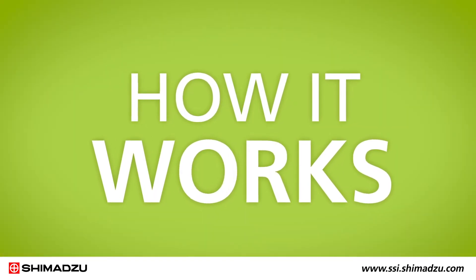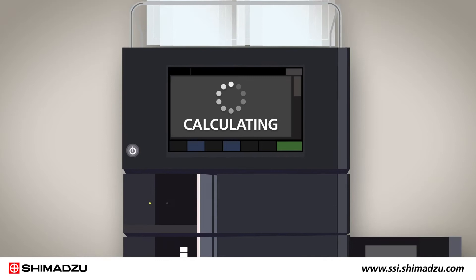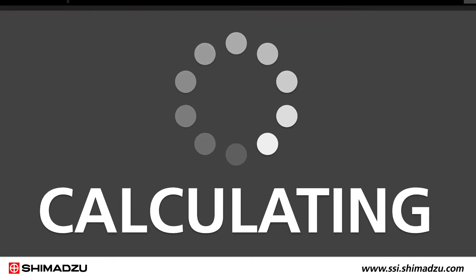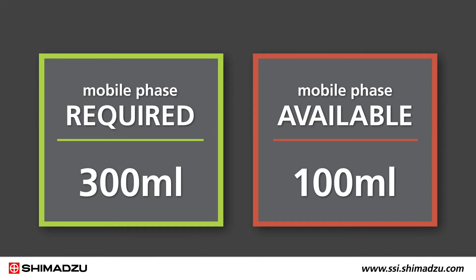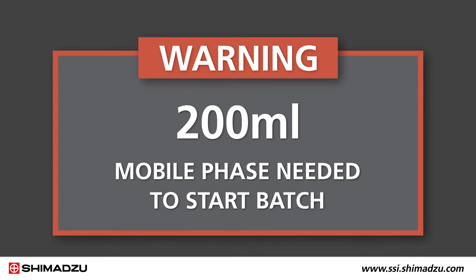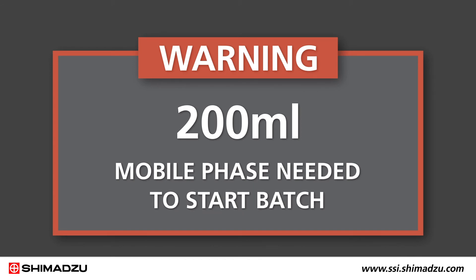Here's how it works. Before starting analysis, the Nexcera automatically calculates the quantity of mobile phase required for the next batch run. It then compares that value to the current quantity of mobile phase in the system. If there isn't enough mobile phase, the system will notify you before starting the batch.